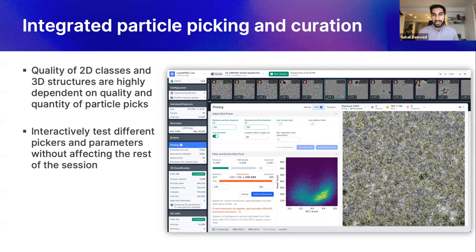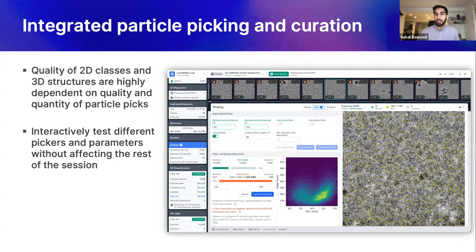Particle picking is the next major step in the processing pipeline, and it is considered a fine art to optimize. Picking a healthy selection of high-quality particle picks typically requires a lot of iteration as you experiment with different picker types, particle diameters, and threshold picks based on their score. We've made particle picking and curation in CryoSpark Live fully interactive, making it easy to optimize the picking strategy over the course of your data collection session. With a single click, you can test adjustments to picking parameters and thresholds and see how they'll change. When you're ready to apply new picking settings, CryoSpark Live will re-pick and re-extract particles from exposures without having to redo other pre-processing steps.